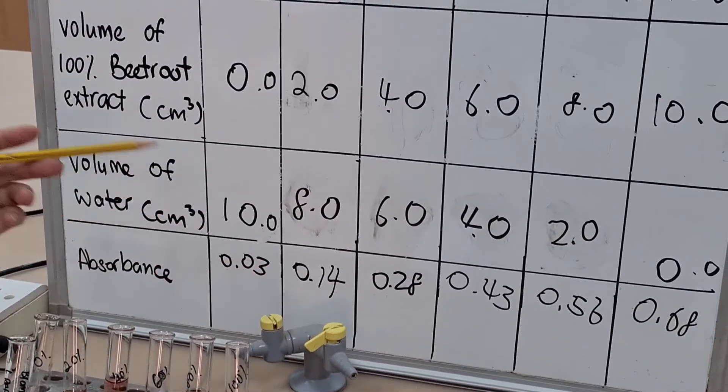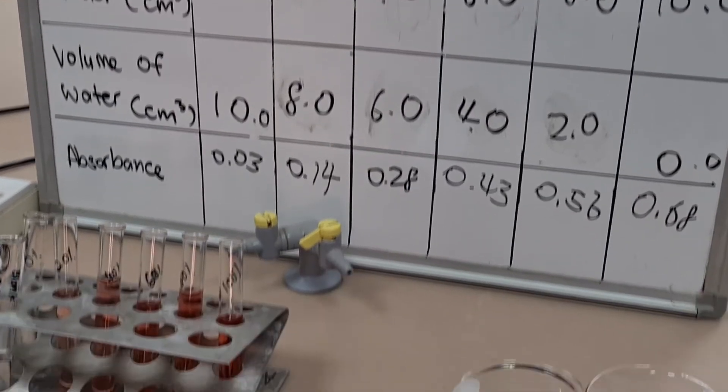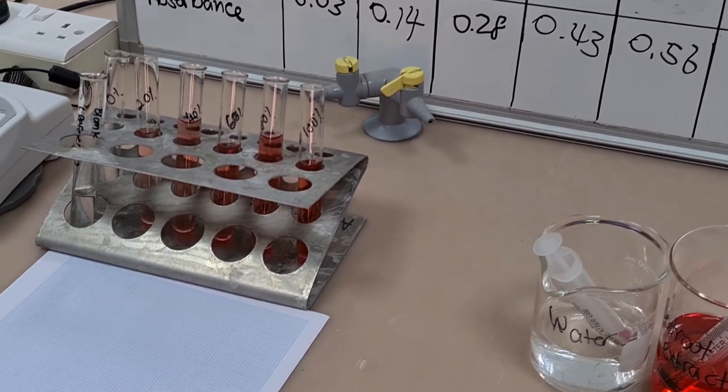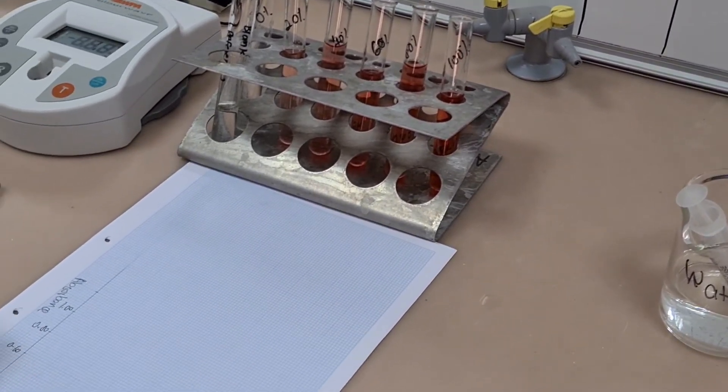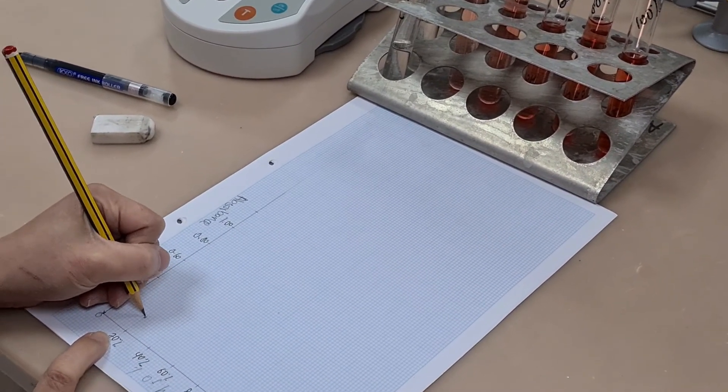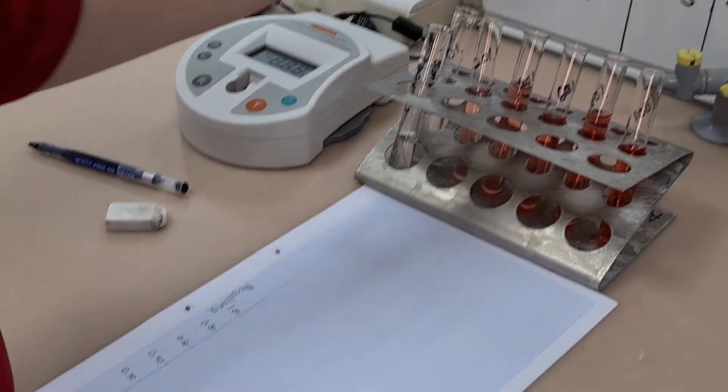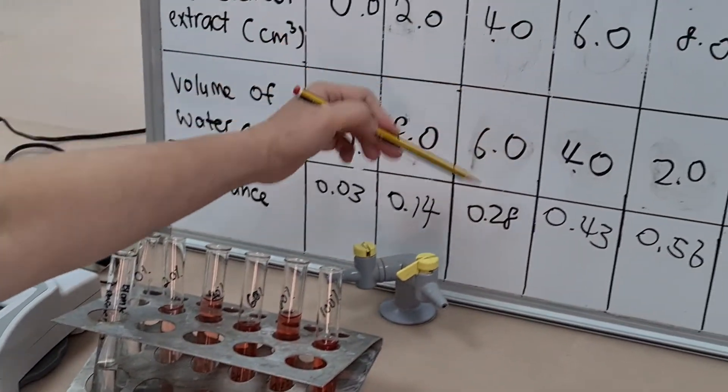The error that's been done on the x-axis is that they've written 20%, 40%, 60% and so on, as well as writing a percentage of beetroot extract. So remember that the unit or the abbreviation for the unit should just appear once in the title of the axis.